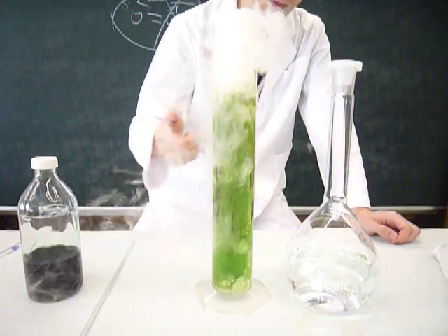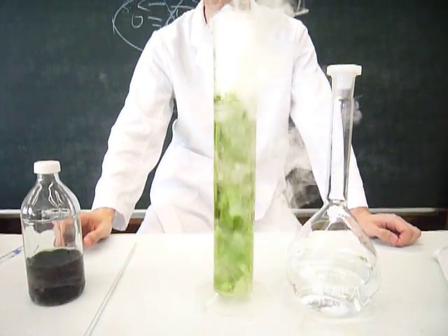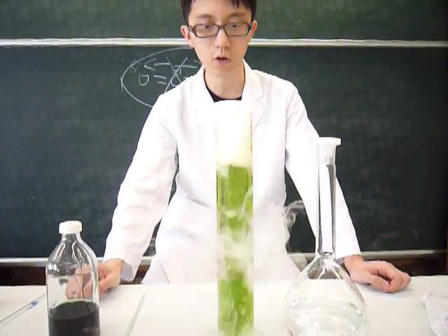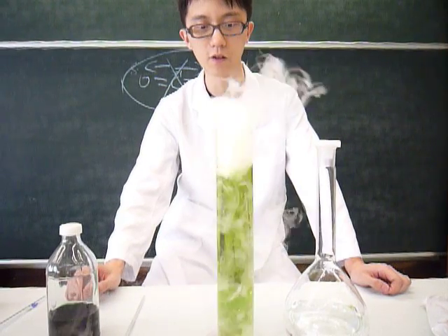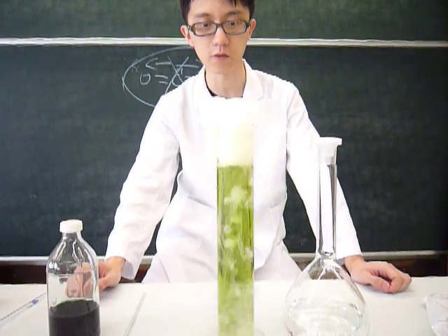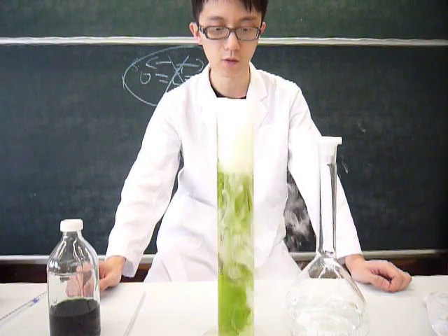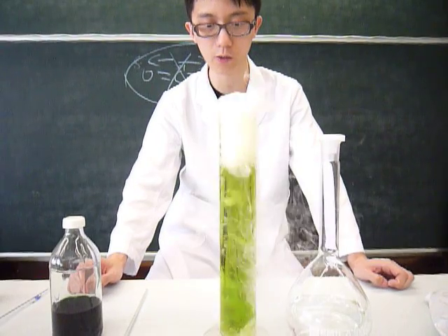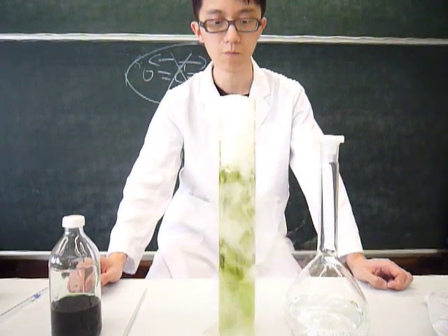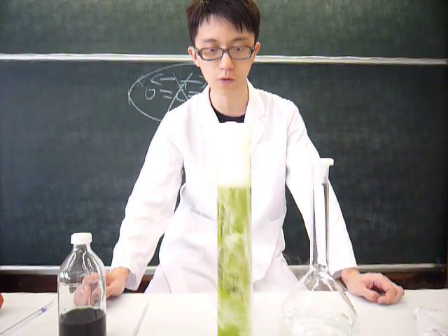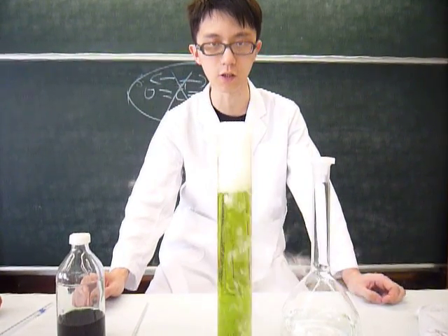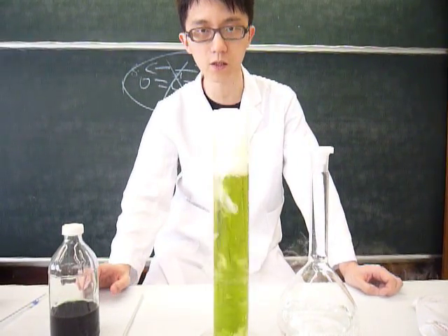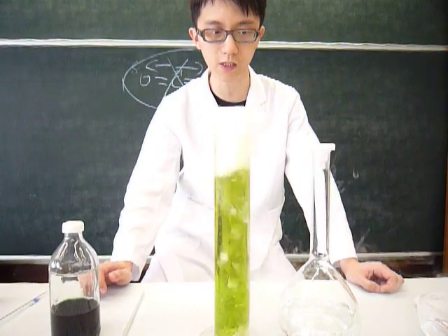As you can see it becomes pale in color, pale green, and actually it is trying to change to yellow. Because all of the sodium hydroxide has been reacted and neutralized by the carbonic acid. Carbon dioxide keeps coming out from the dry ice through sublimation and it dissolves in the solution to form carbonic acid continuously, making the solution turn yellow because it is slightly acidic.